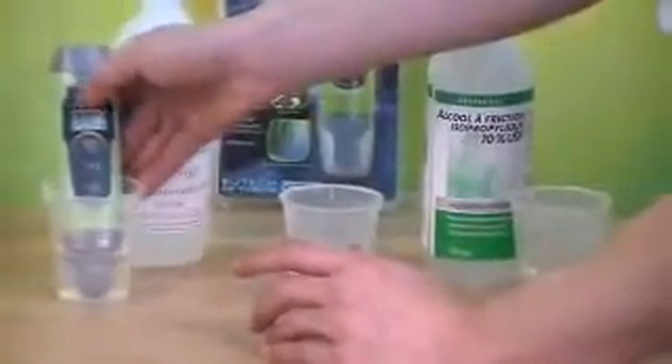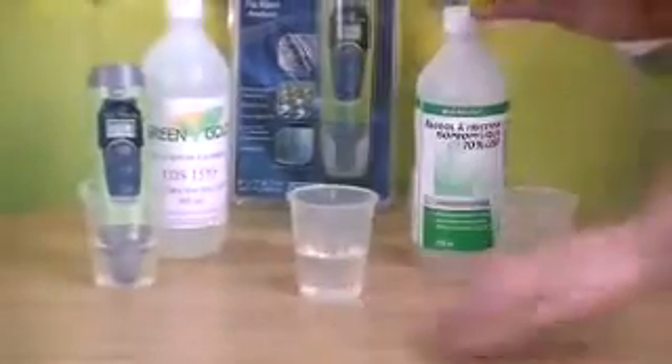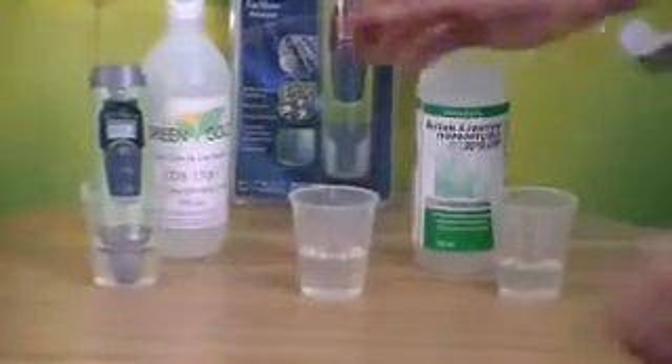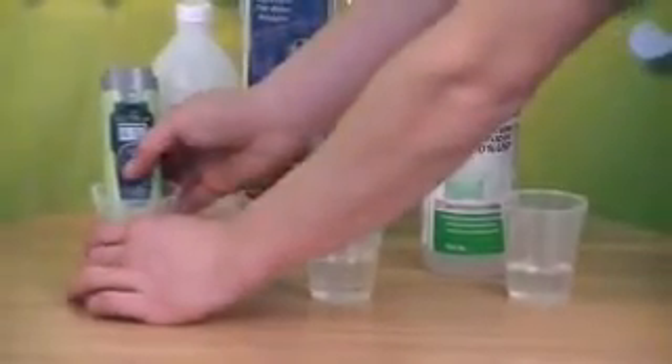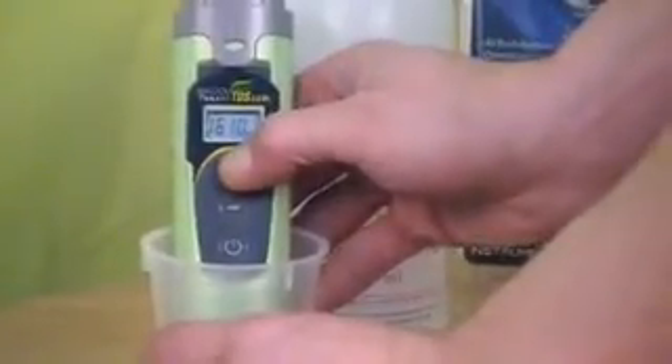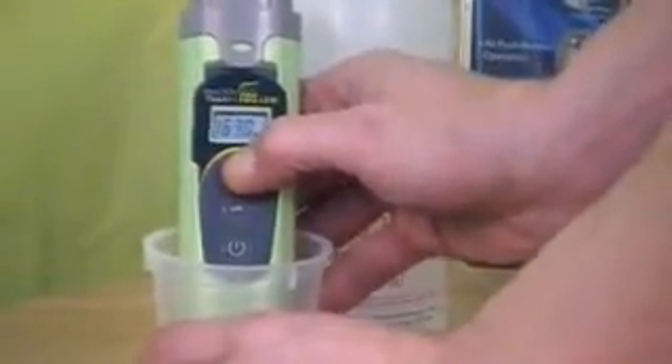You wait until the number stabilizes before you start trying to calibrate. Once it's stable, you press the cal button one time and it should flash CAL. After that it should flash the number — adjust it with the hold enter button to 1500.